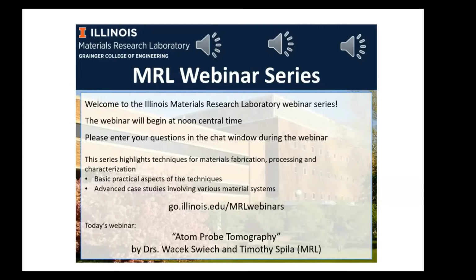Became a staff in the MRL in 2004. He wears many hats here. He is responsible for our SIMS and TOF SIMS capabilities. He has been in charge of our ion beam accelerator, where we do RBS analysis as well. And due to his extensive background in thin films, mass spectrometry, and CAMECA systems, we actually asked at some point for Tim to be one of the responsibles for the newly acquired atom probe tomography system from CAMECA, which was installed in early 2019.